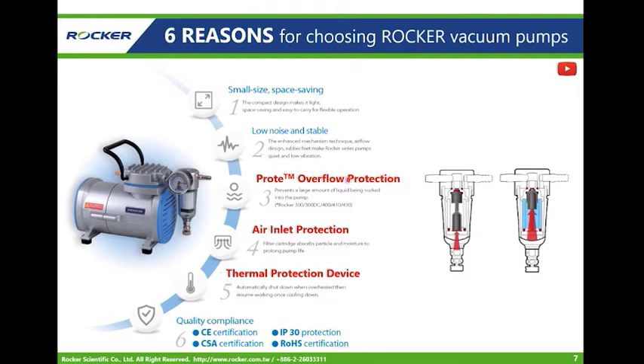First, the overflow protection: when liquid is sucked into the trap, the buoy — the black part — floats up to block the air inlet and prevents liquid from being sucked into the pump. Next, the air inlet protection: a filter cartridge — the white part — is equipped before the air inlet to filter particles and moisture in the air, preventing dust from entering the pump. The last one is the thermal protection device: each Rucker pump will shut off automatically when overheated and resume working when cooled down. These three safety features provide maximum protection and prolong the service life.